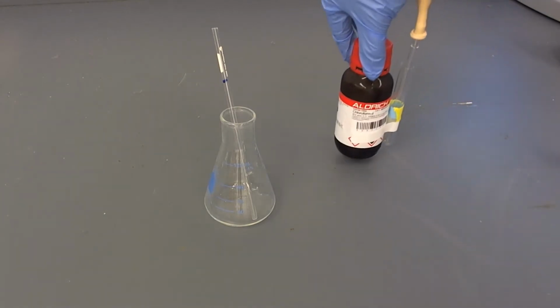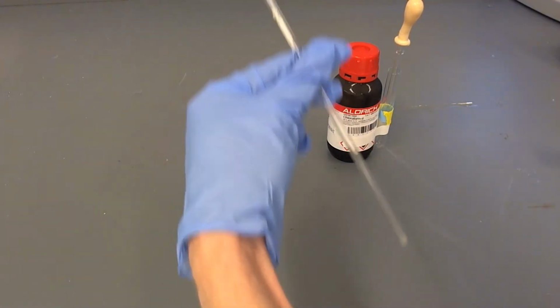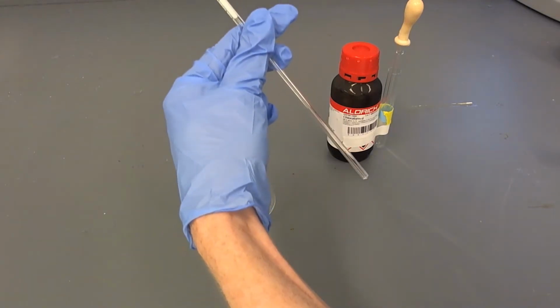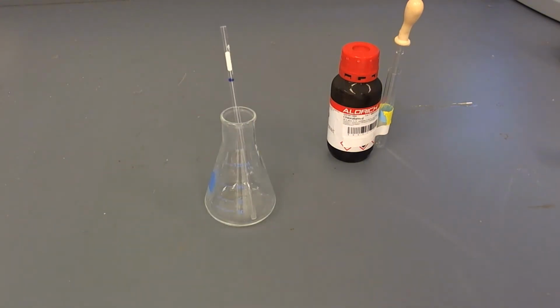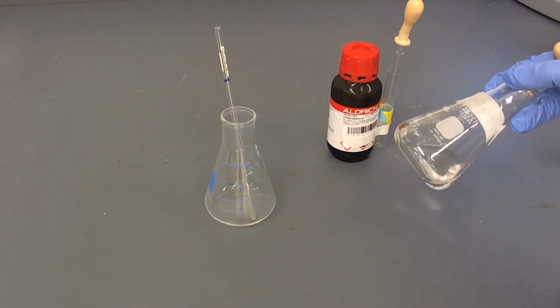This is a stock bottle with a pipette that we only use for dispensing that solvent. We also need an NMR tube, which is a skinny glass tube. These are expensive and fragile, so don't just throw them away. First let's take a look at if we have a sample of a large quantity of liquid, like this Erlenmeyer flask, which is a lot of sample.